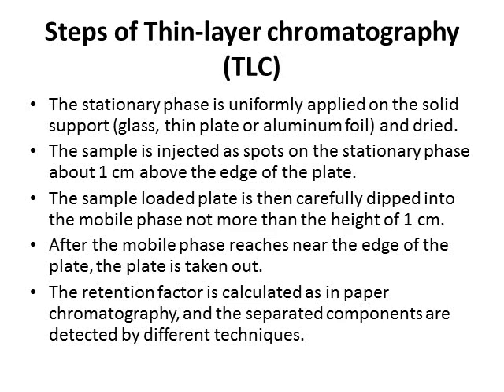The sample loaded plate is then carefully dipped into the mobile phase, not more than 1 centimeter. After the mobile phase reaches near the edge, the plate is taken out. The retention factor is calculated as in paper chromatography, and the separated components are detected by different techniques.